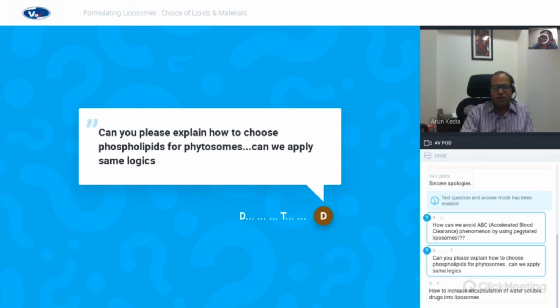Then, depending on your other factors, you may choose the right grade of the natural phospholipid. This is not to be ignored, because, for example, in our company within soya, I think we have something like 25 grades. So the choice of the grade is also important.